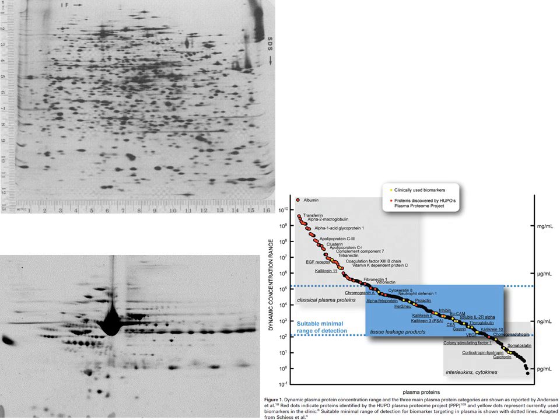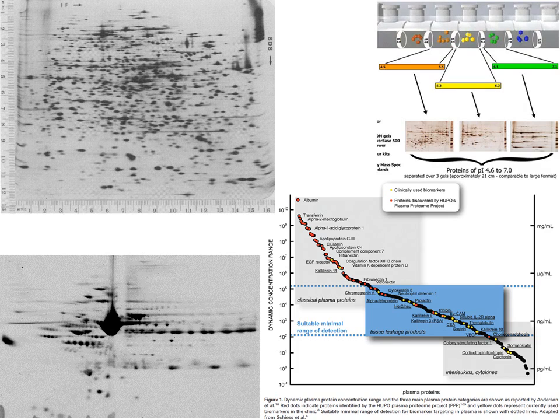Both of these problems can be somewhat dealt with by fractionating by charge in liquid using carrier ampholyte IEF and then loading those fractions onto narrow range pH strips. Few researchers have really pushed the limit of this type of approach, mainly because there is a lack of automation that makes LC-MS-MS approaches very attractive.